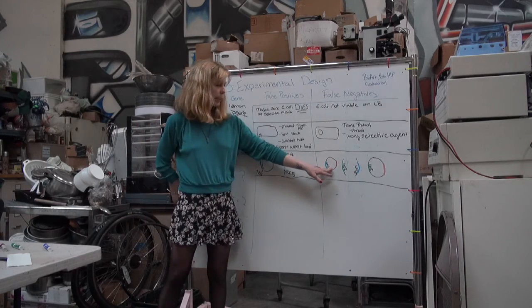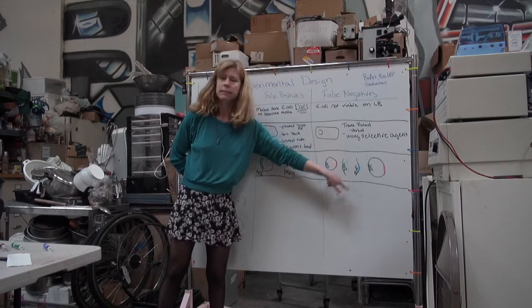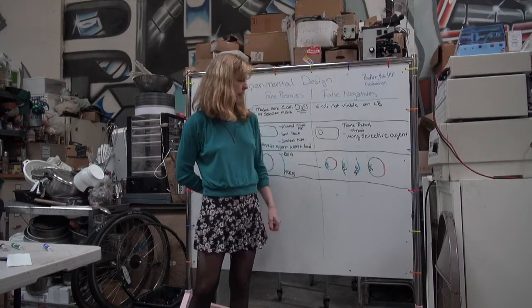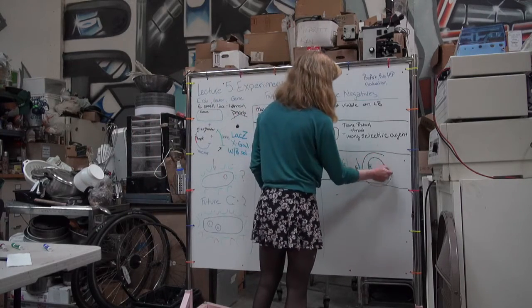So I cut out my plasmid and all of it's cut, so I have these two parts in the same mix. I have some of this that doesn't get cut, but you can't really tell much of the difference. In the end, I want this product here.